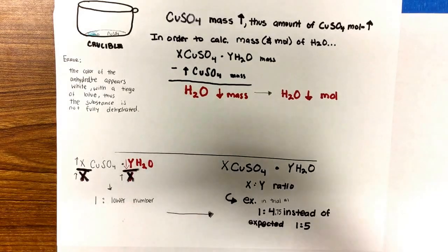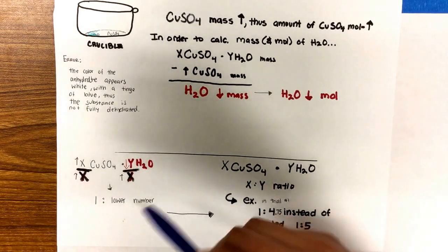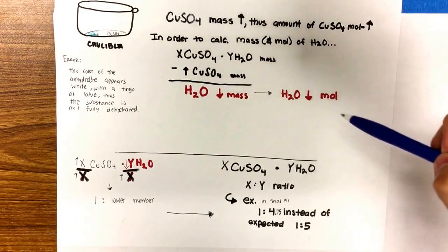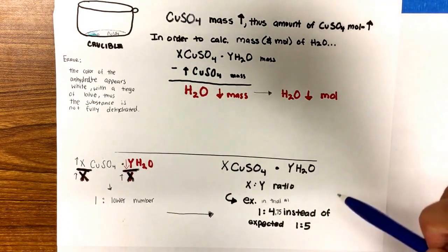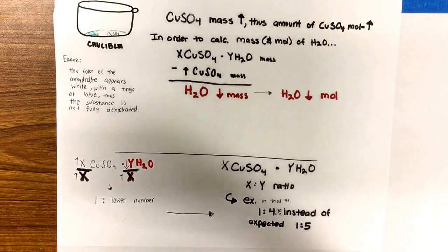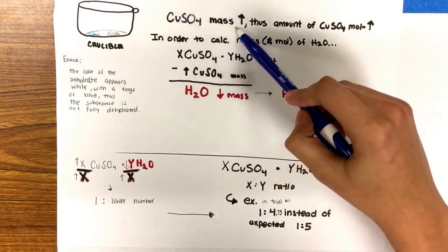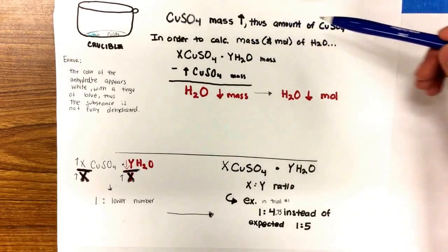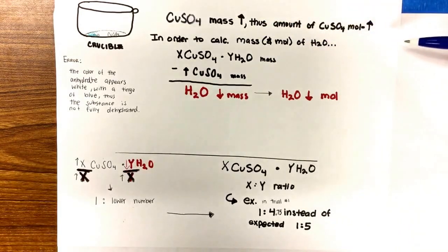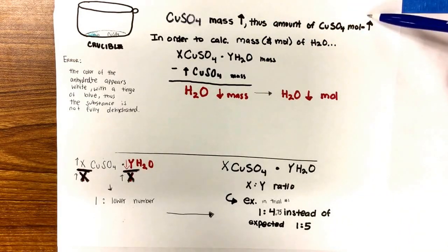A student could have perceived a tinged blue-white substance to be fully dehydrated when in fact it was not. Therefore, the CuSO4 mass, which is the dehydrated substance, would have been increased and therefore the amount when converted to moles would be increased.